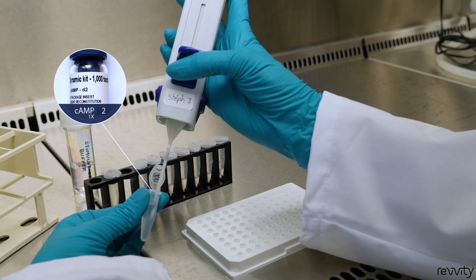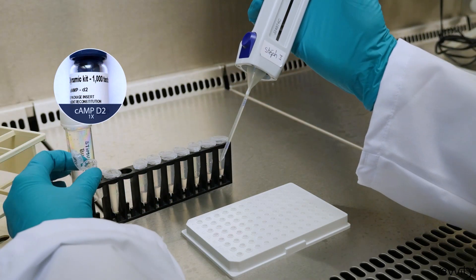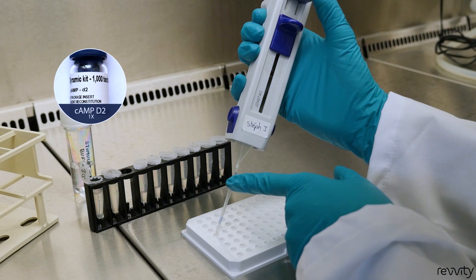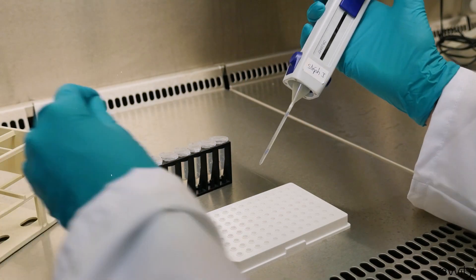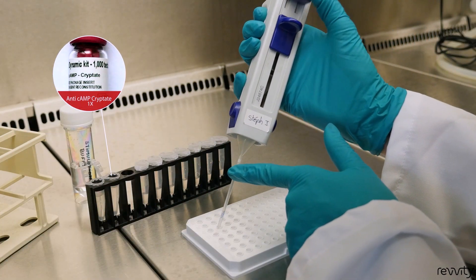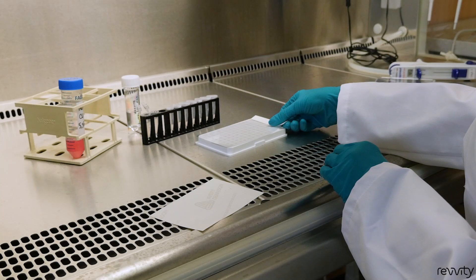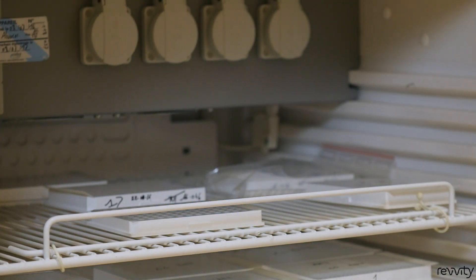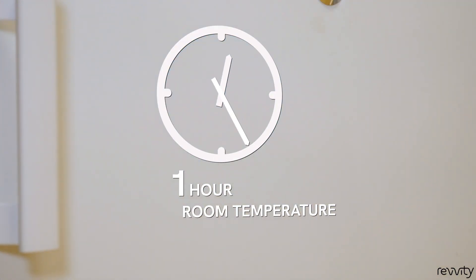Remove sealer and add first 5 microliters of labeled cyclic AMP, then 5 microliters of anti-cyclic AMP antibody. Incubate 1 hour at room temperature. And that's it.